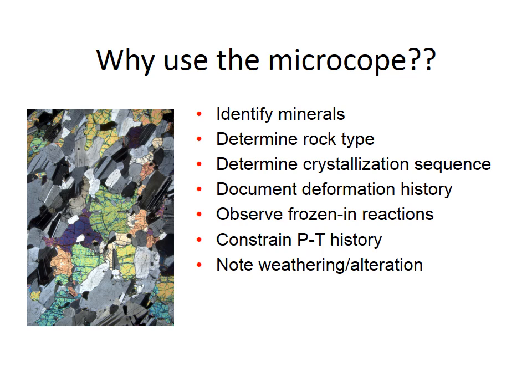First, you might want to consider why we use this tool. Under the microscope, we can more precisely identify minerals and classify rocks, and often we can see textural information that reveals the history of a rock in a great deal more detail than what we can see in the field or in hand specimen, so it's just a very powerful tool.